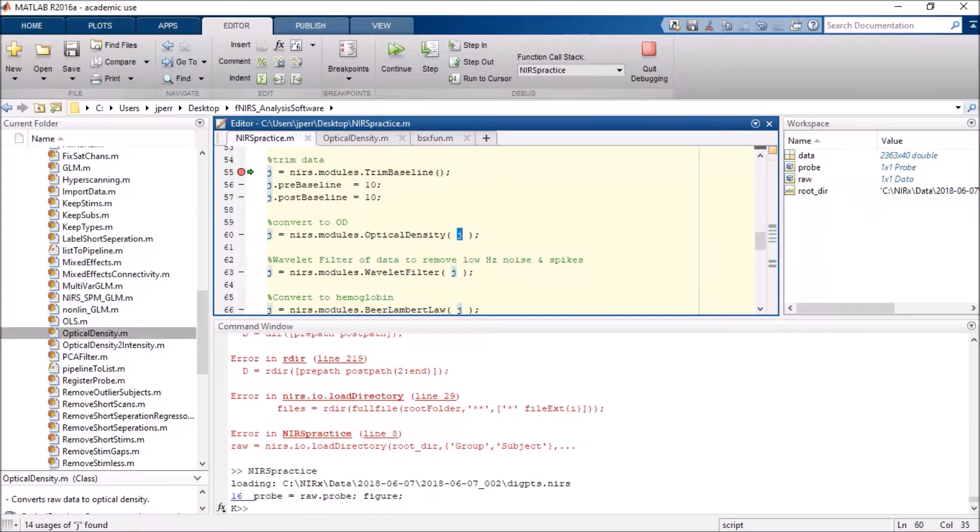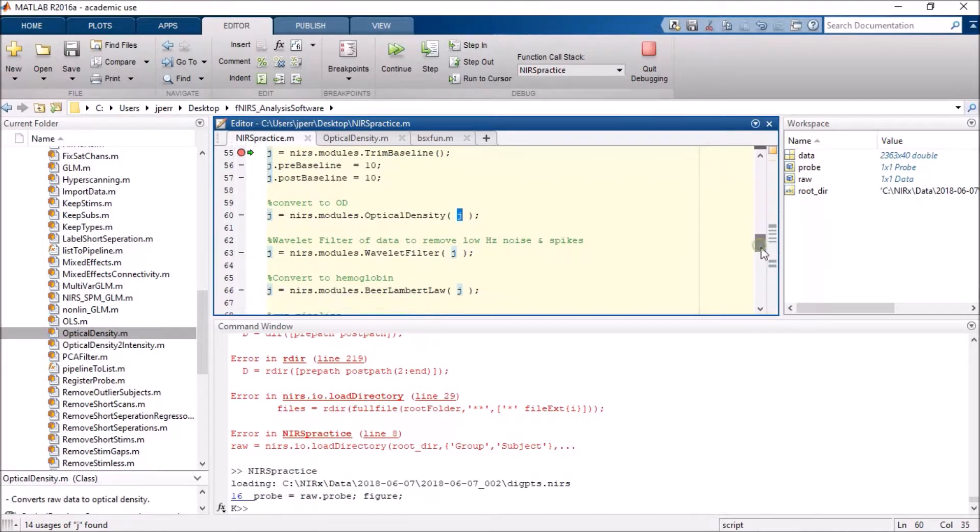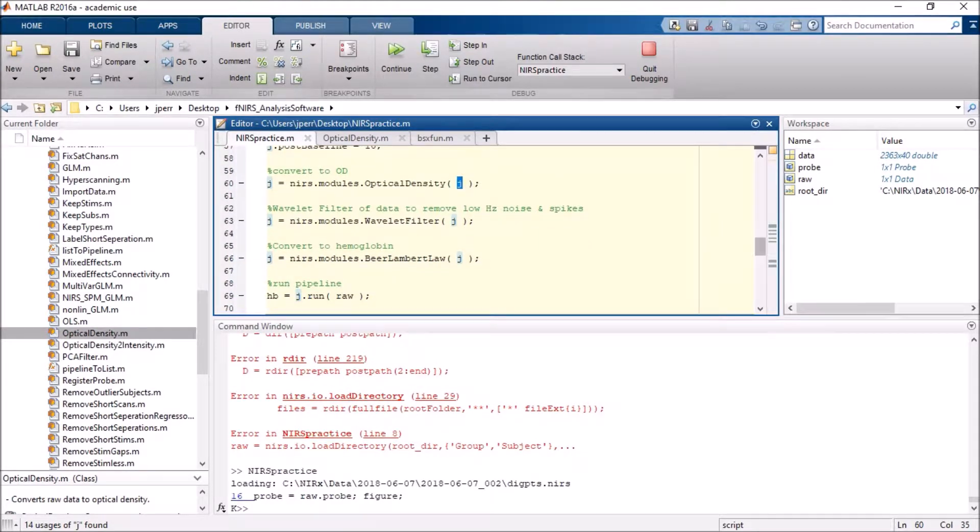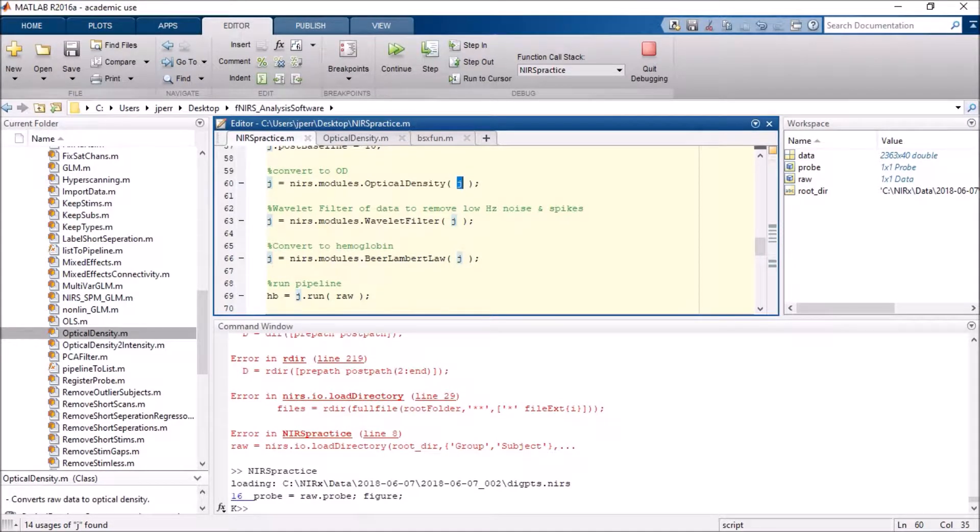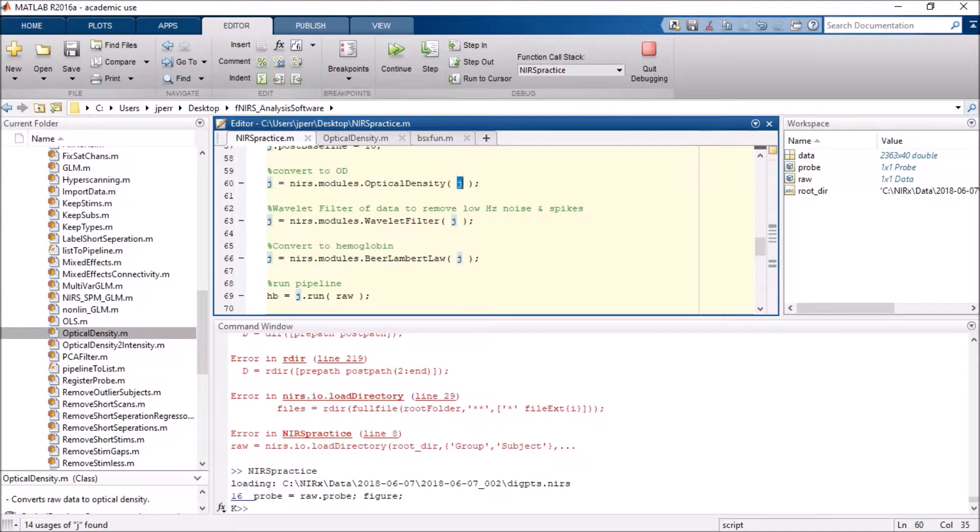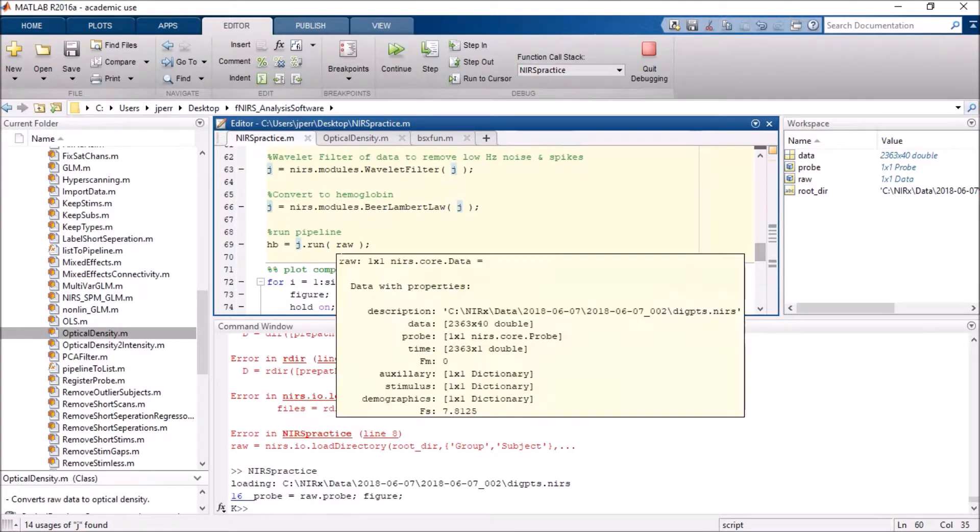So I use the initial job, I resave as the new job. From there I input into the next line, use a wavelet filter here, and then redesignate it into the Beer-Lambert Law, save it again. And finally I actually run the pipeline that I designated.